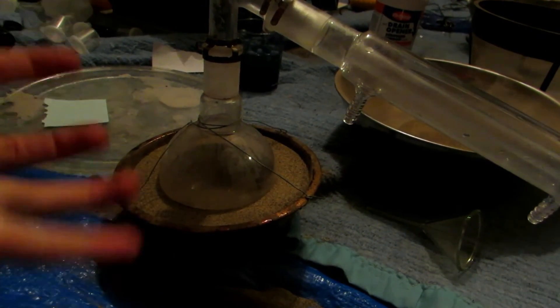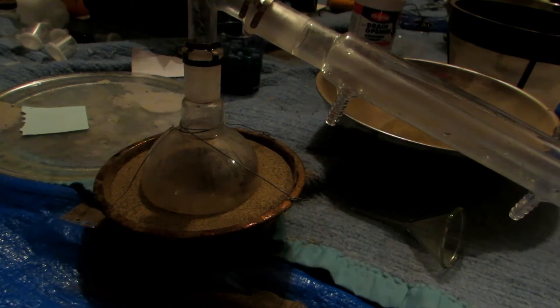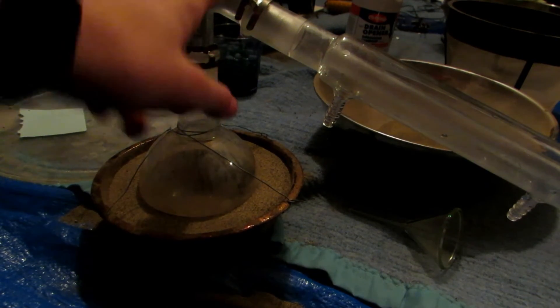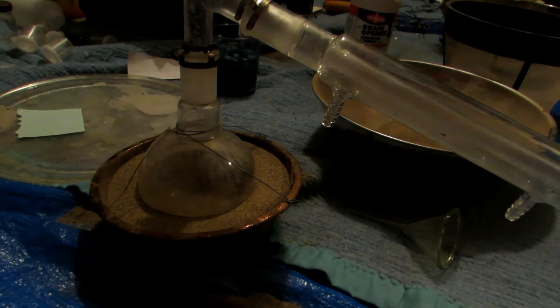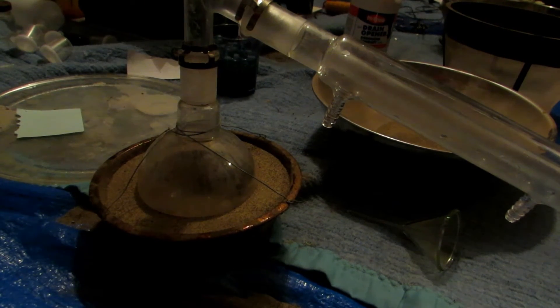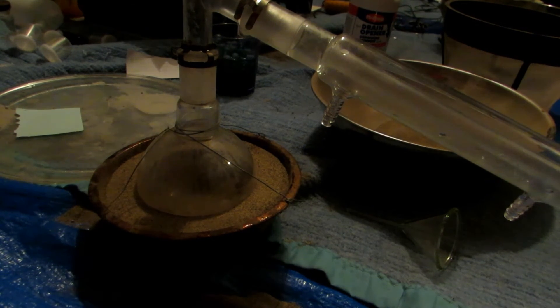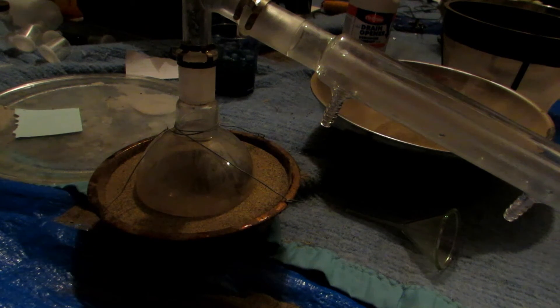I set up the rest of the distillation apparatus and we're now ready to take it outside and put it on the camping stove. No water condensing will be used, because the glassware would be about 350 degrees at the flask end and near 0 degrees at the other end — it's actually snowing outside. With that temperature difference, it's very easy for the glassware to crack and possibly explode, spraying hot sulfuric acid everywhere, which would give us nasty burns. It's never recommended to push glassware this hot, but I really do need to do this sulfuric acid distillation.